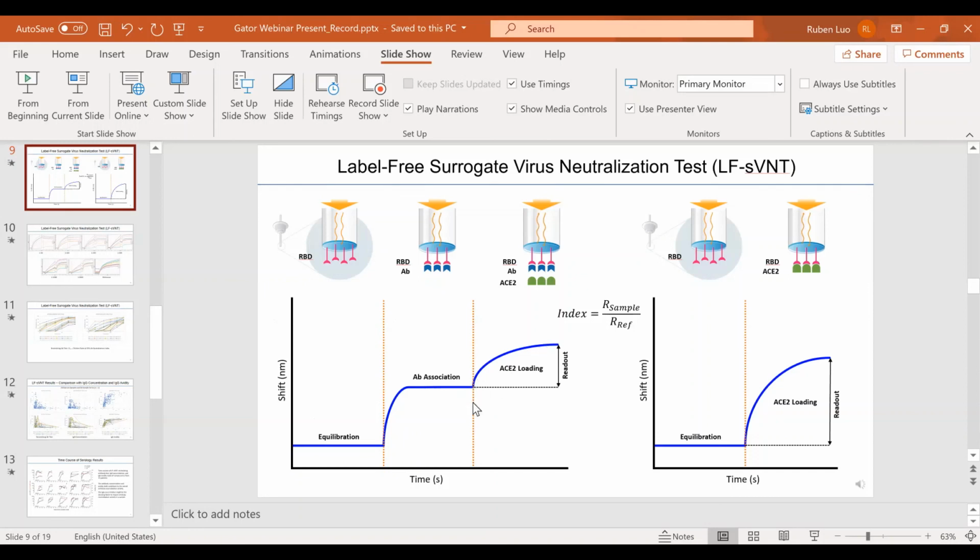Oh, I see. Yeah, this is a great question. Whoever asked this question might have a background in label-free biomolecular interaction measurement. Actually, we did consider whether we can extract information from the binding kinetics. For those who ever did label-free characterization of biomolecular interactions, we can get K on, K off, and the equilibrium constant KD just from the association and the dissociation curves.